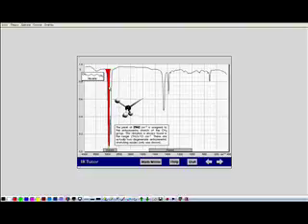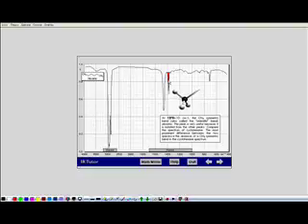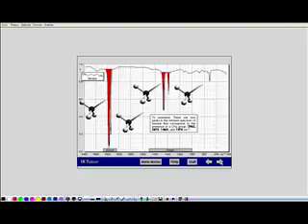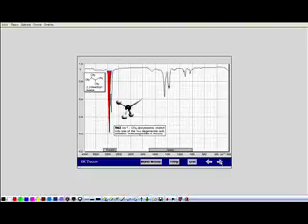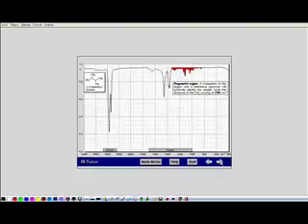And there's other types of stretches here. There's whatever this one is. That's a rocking motion, basically. And I don't even know what this one is. That's a bending motion from the CH3. And then down here, there's whatever that is. A fairly complicated motion. So all these different motions are characteristic of an alkane. And all alkanes are pretty much the same. You get some very weird motions like that for this. This is the 2,3-dimethylbutane. But you pretty much end up with just these same types of motions.